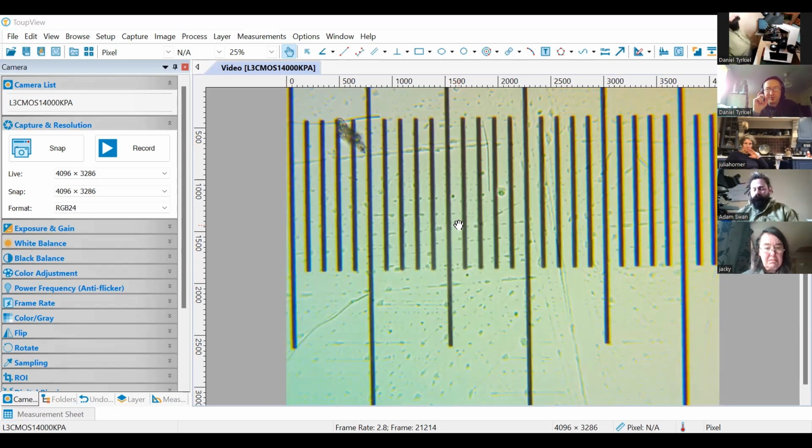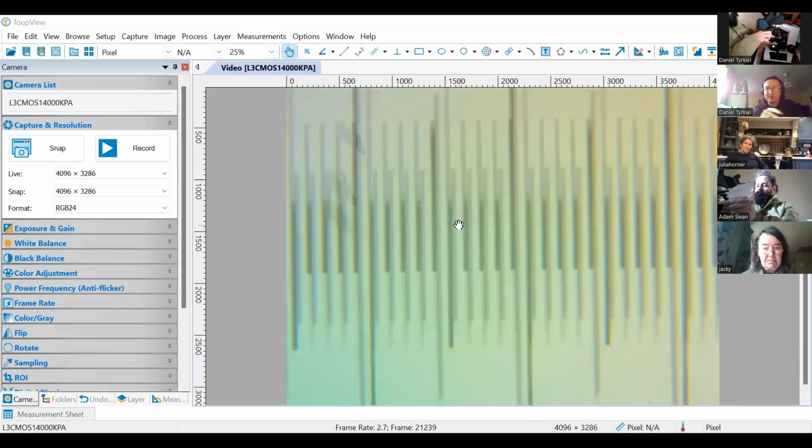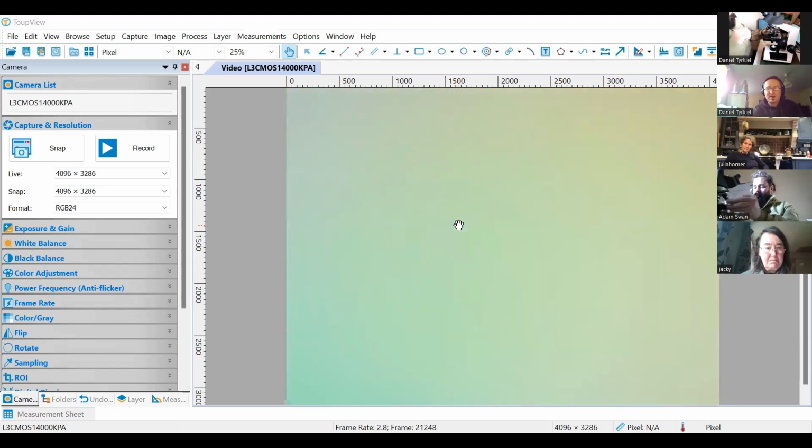And so if you get used to making samples using a slide like this, then you train your brain to assess the width of the fungal hyphae based on this image. And that makes you more accurate in your measurements.